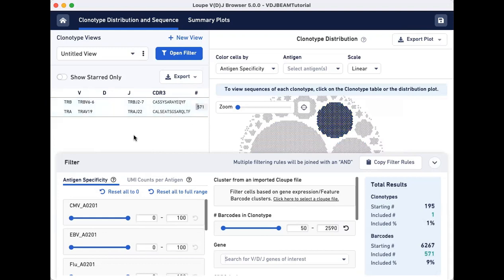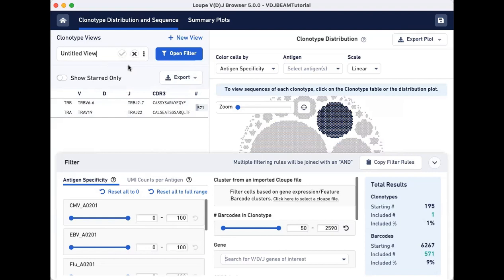Now let's save these filters. Click on the three dots next to the filter name. You can edit the view name to something more meaningful. For example, we will call this Jan 2023 COVID. Then click on the check mark next to the name to save.